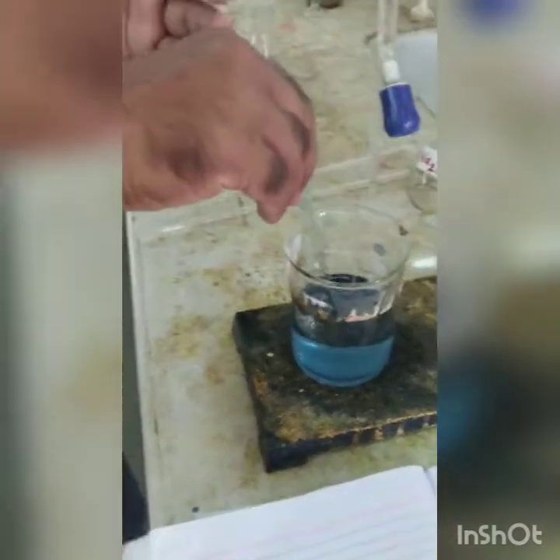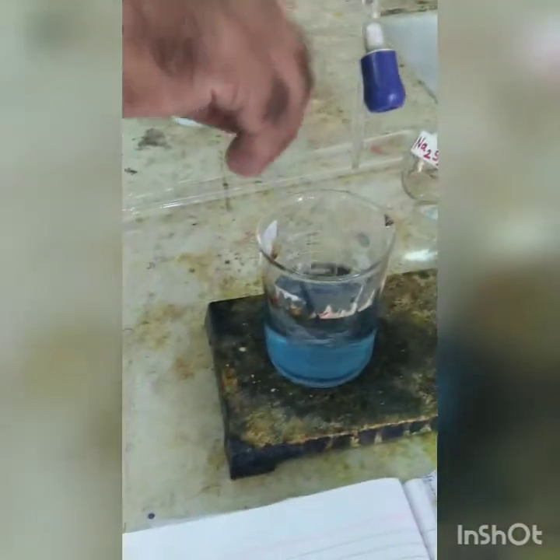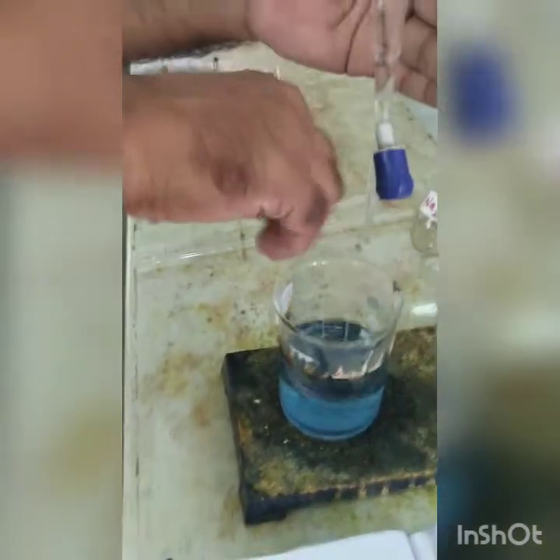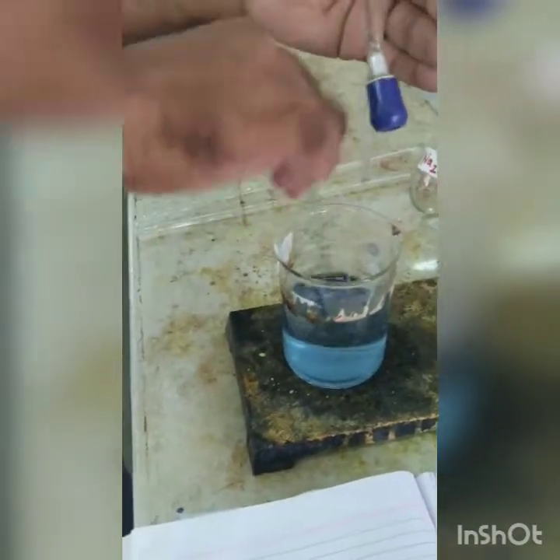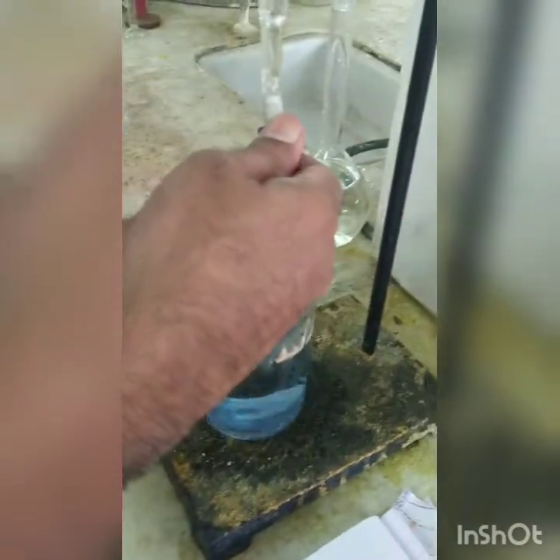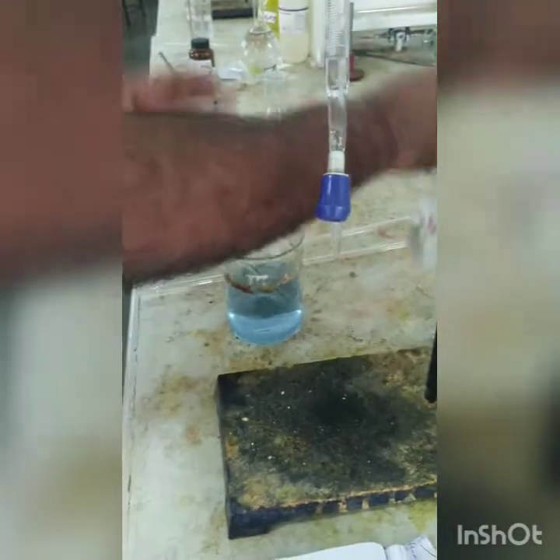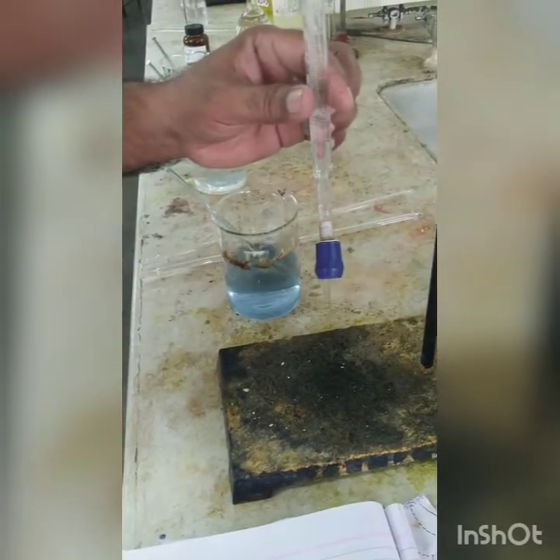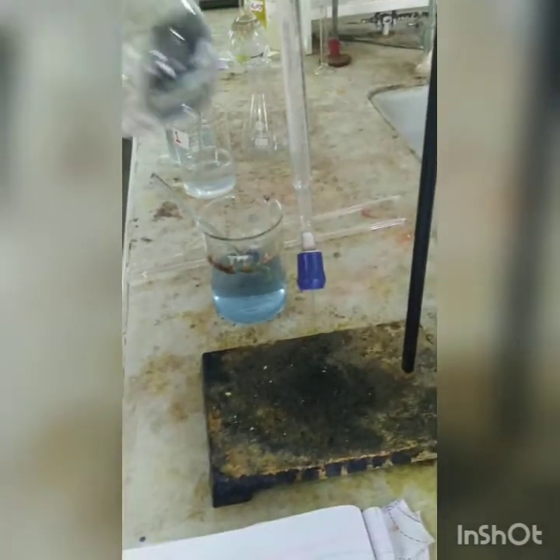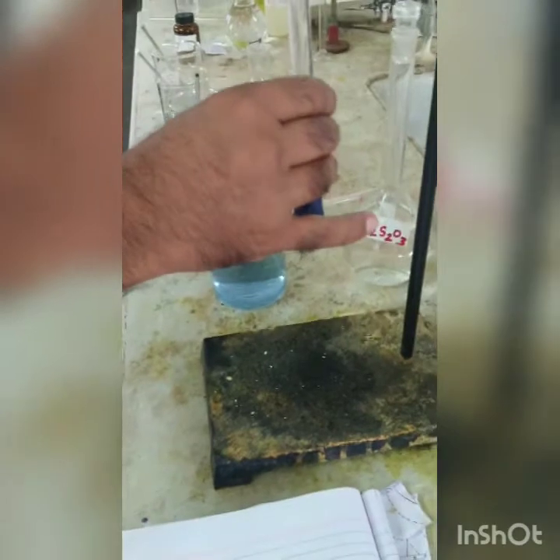After this, we have to plot a graph. Okay. First, we have to see what is the chlorine demand. Then we have to find how much is the residual chlorine. Then we have to plot a graph between applied dosage on x-axis versus residual chlorine on y-axis. So, to get a residual chlorine of 0.5 mg per liter at the water treatment plant, how much dosage is required to be applied? That is what we have to find from this graph.